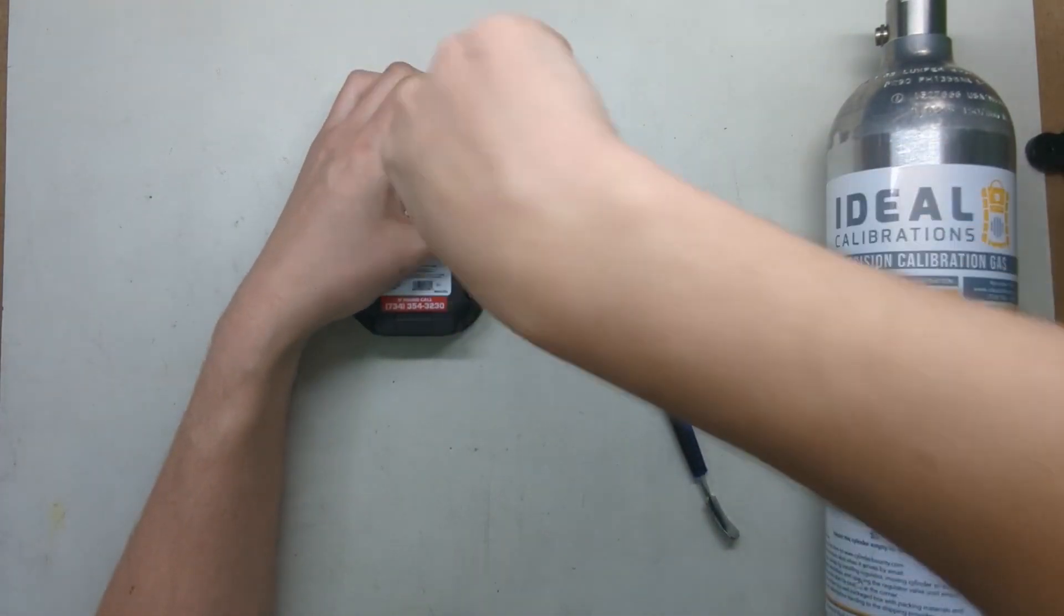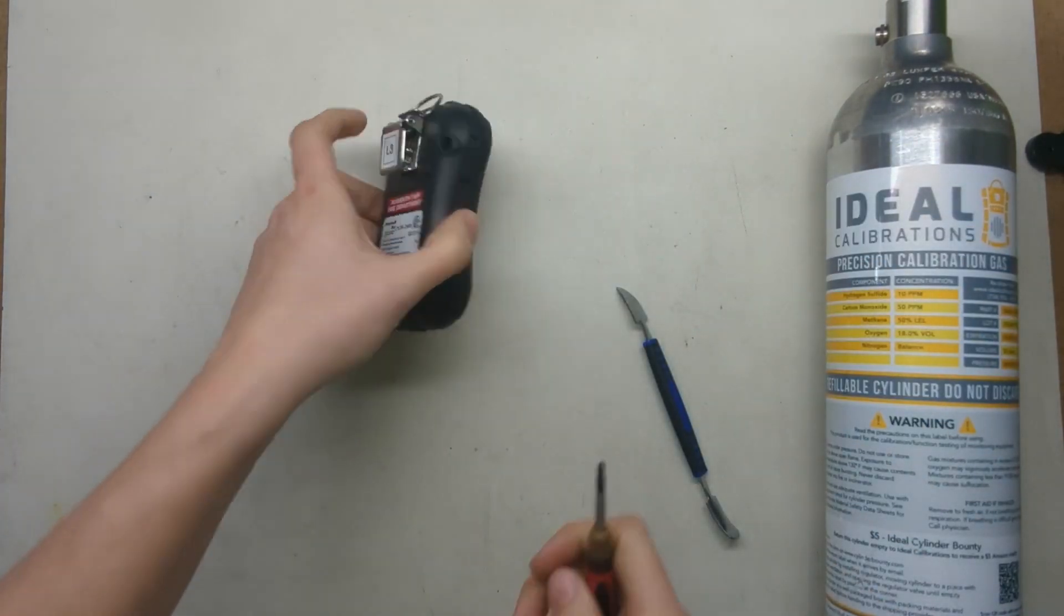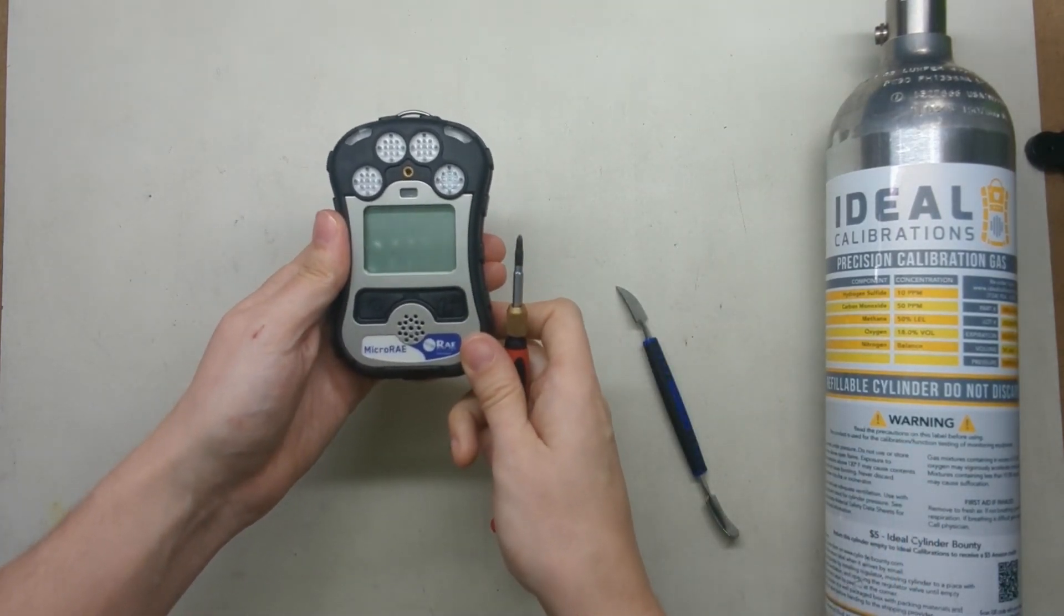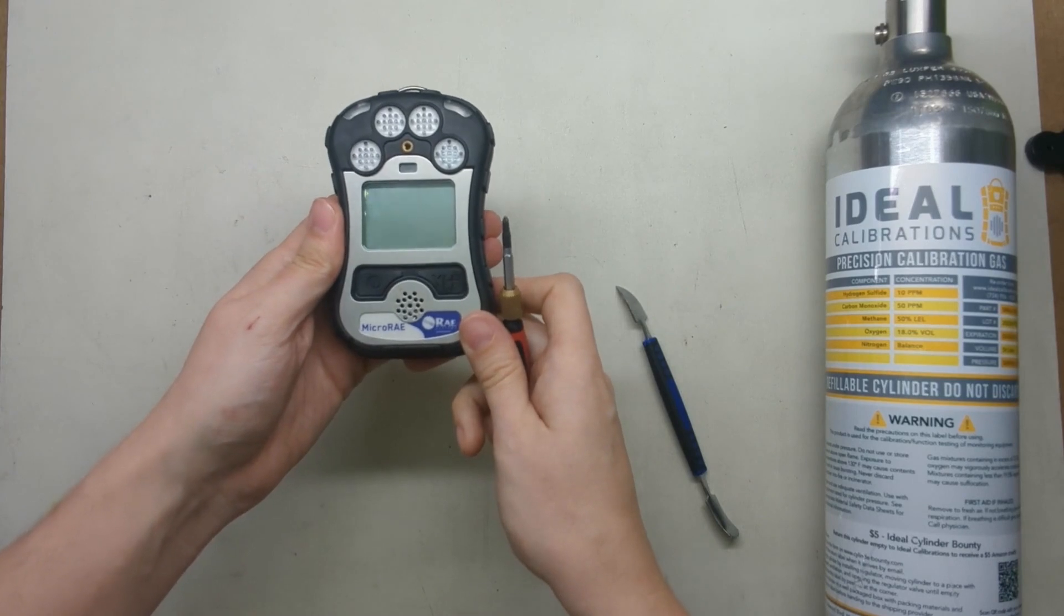And then afterwards you want to turn the unit on and you want to give it a good calibration. The cylinder of gas, make sure it's not expired. We'll show you how to do that in another video.